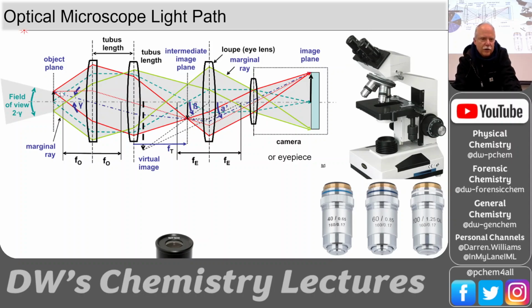This is what you're viewing with the microscope. So you've got this tiny little arrow here, and you can trace the rays from the arrow tip. This image is focused on that spot. You can follow the red images. Here you have this intermediate image, where it shows up upside down and a little bit bigger. Then it goes in through the eyepiece, and it shows up over here magnified. You see it's gotten larger.